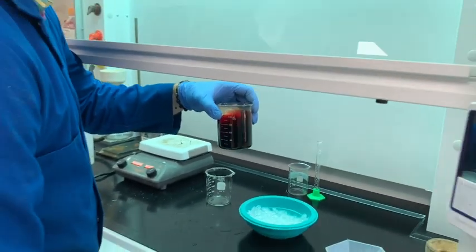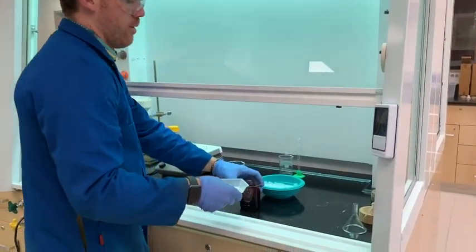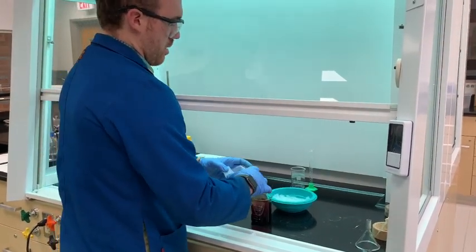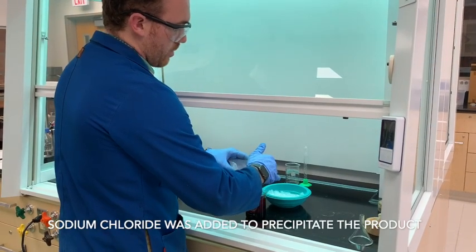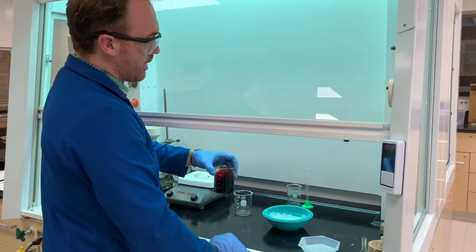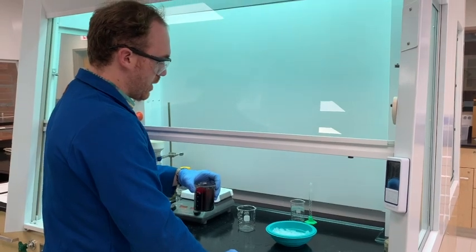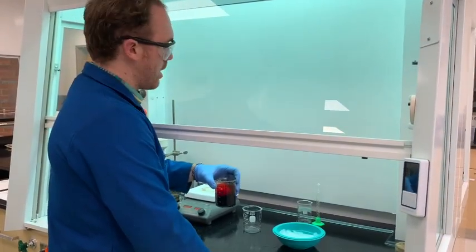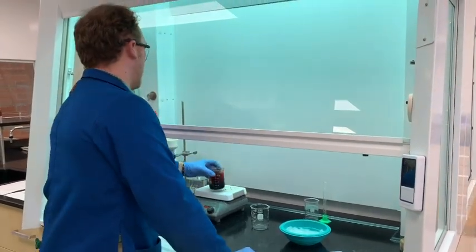So what we're going to do now is take some of this sodium chloride that I weighed out, about 5.03 grams of it, and we're going to just add that to help salt out the product. What you might notice right away as soon as you add that sodium chloride is it becomes a little bit chunky, and that's because you're already taking a pretty insoluble compound that is not that interested in sticking around in water, and you're making it even less soluble.